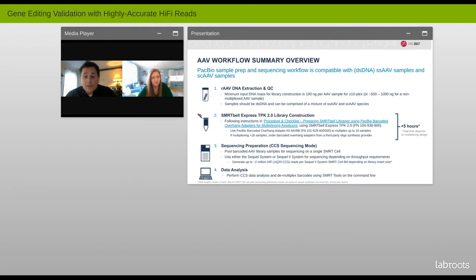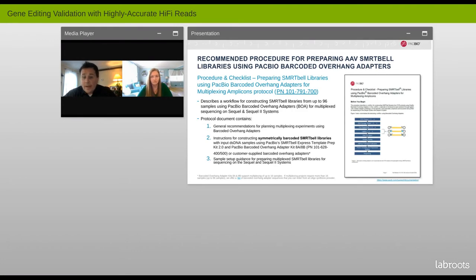And that's pretty standard molecular biology, where we've been able to leverage all those different things that we've done in a few different places. After that, the sequencing preparation and some of those other things that a service provider would have are pretty straightforward. Again, we've had a few other workflows, and I'm trying to buffer for how I would approach this type of strategy for long read sequencing.